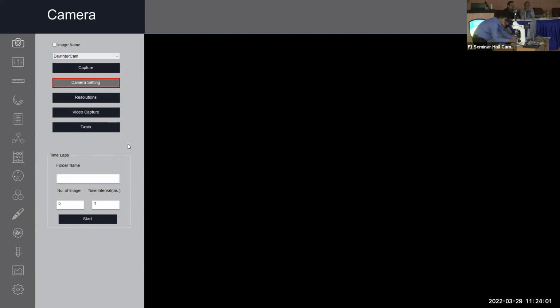Obviously, this is a time-taking procedure. When you are focusing a fluorescent microscope, it takes a lot of time. And once you have focused it, then you can search the field for a particular cell or so, and then you can take a picture. It's not that you take a picture like you take on your mobile phone. It is not so easy.